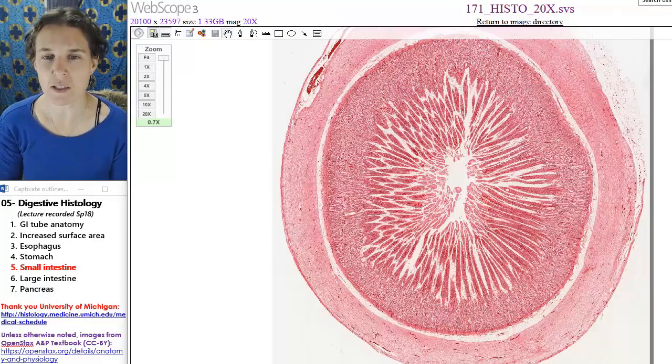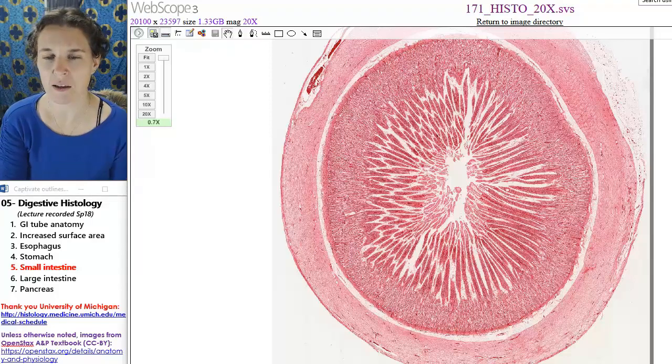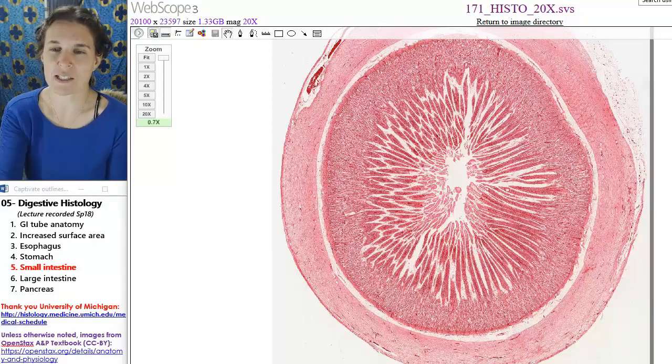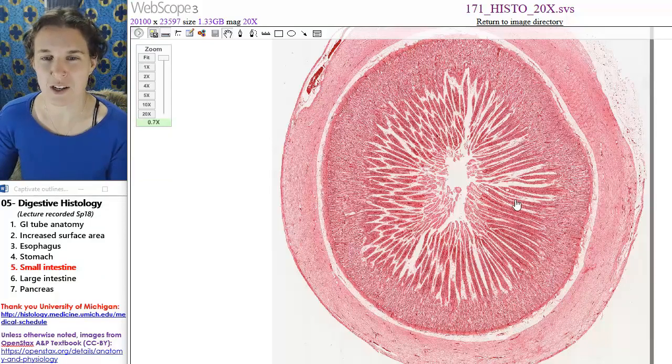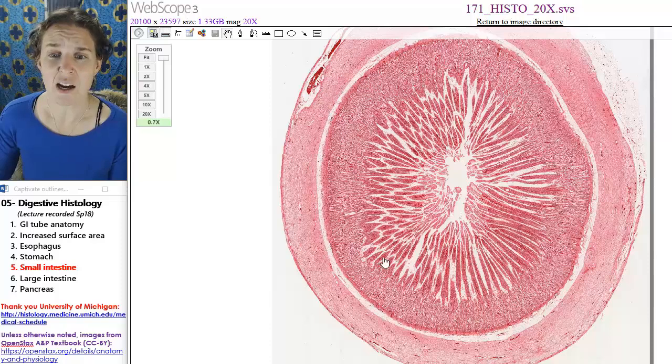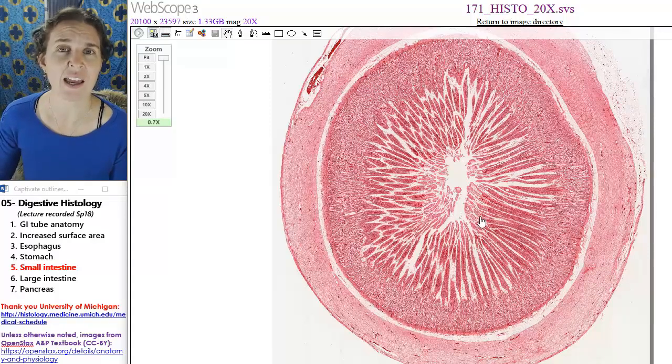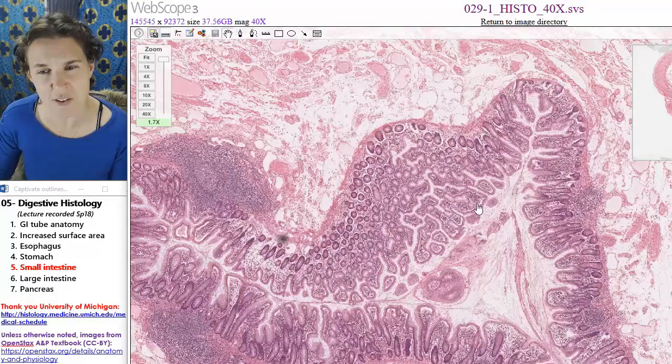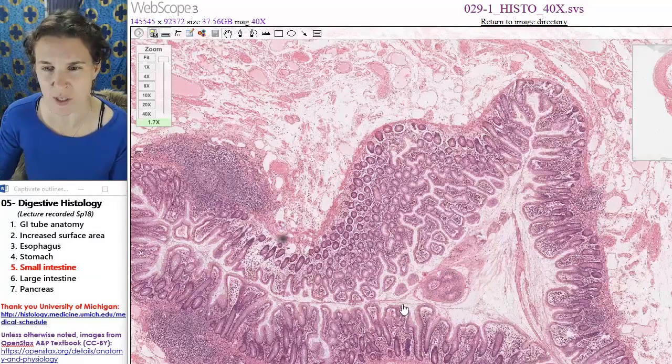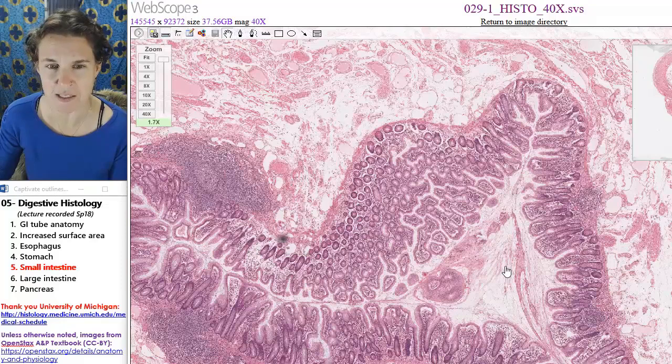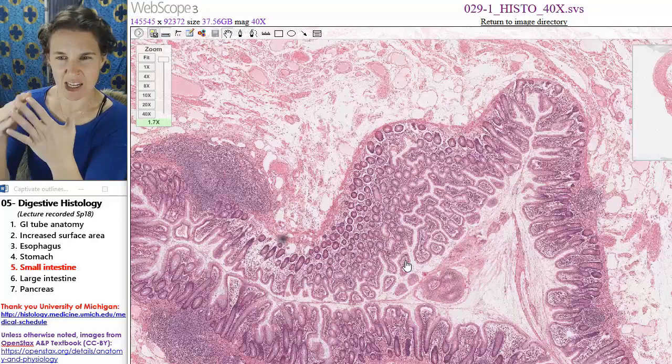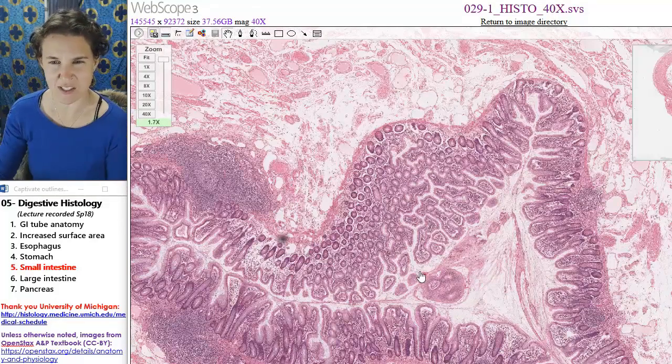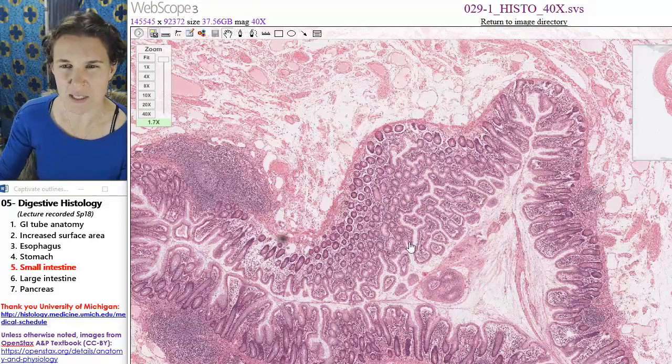Does this look like a lot of villi? This is like a quintessential image of, yeah, those are long, skinny, thin, fine villi. And that's jejunum. Here's the other thing. Here's that thing that I was telling you. Here's my lumen of this tube. And you can see those villi just got cut in—it almost looks like giraffe skin. If you see something like that, it's significant.